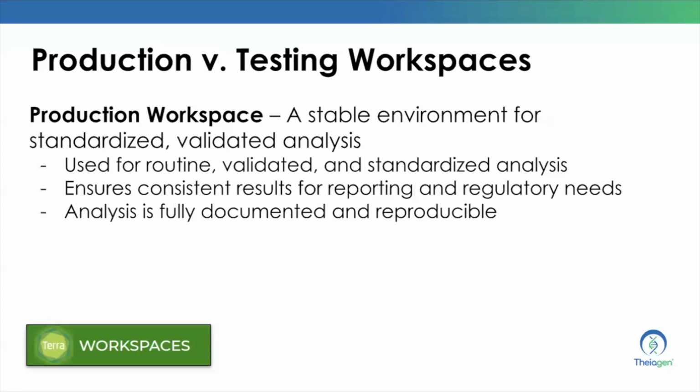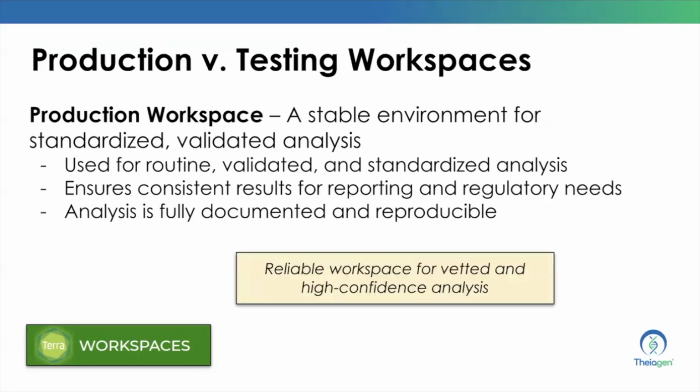A production workspace is meant to be the more stable workspace. It should be used for routine, validated, and standardized analysis. This ensures consistent results for reporting and regulatory needs. And analysis in a production workspace should be fully documented and reproducible. As a rule of thumb, a production workspace is meant for high confidence and vetted analysis.